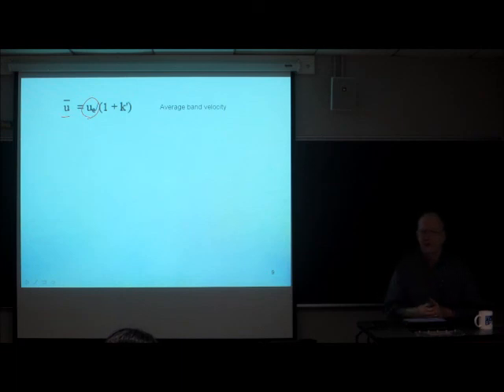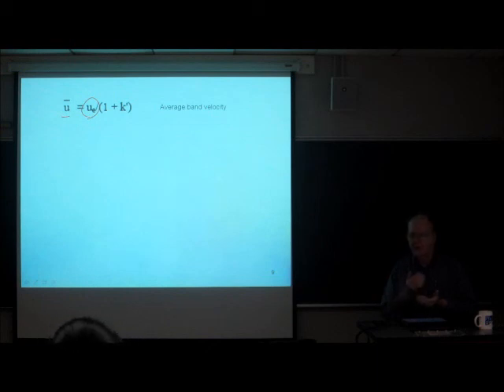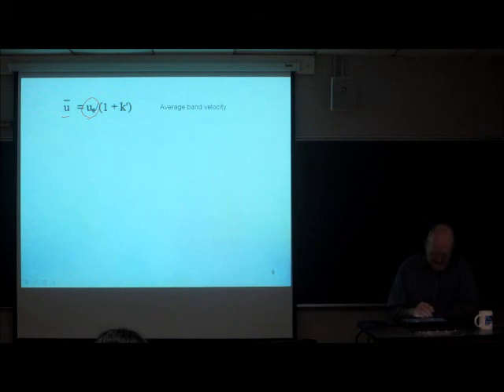The velocity of the molecules when it's in a stationary phase is 0. So we don't need to know the fraction of the molecules in the stationary phase. So if we take the velocity when it's in the mobile phase and multiply that by the fraction of the molecules in the mobile phase, that's got to be the average velocity. That's what this is.